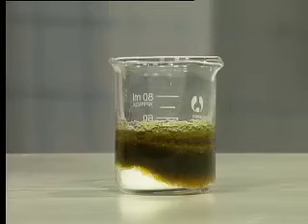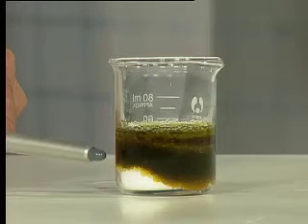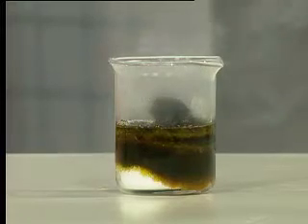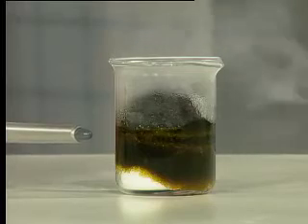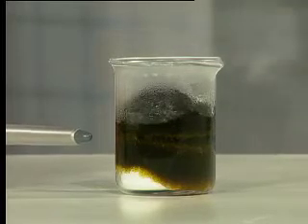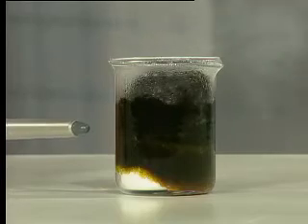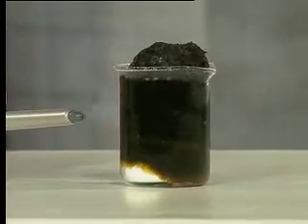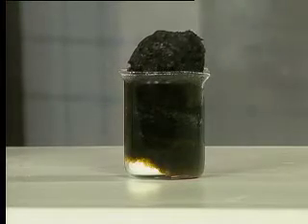Look what's happening already — the sugar is turning black, it's going dark brown, and it's starting to bubble to release. Watch carefully: it's releasing lots of gas and it's producing a large lump of a black substance that's spluttering up and rising out of the beaker.